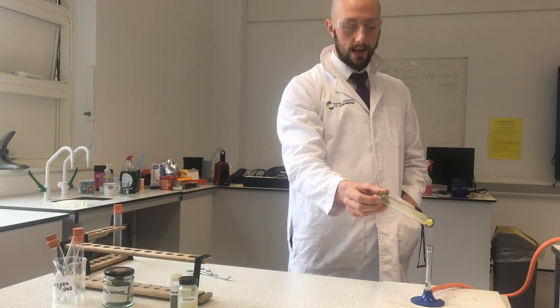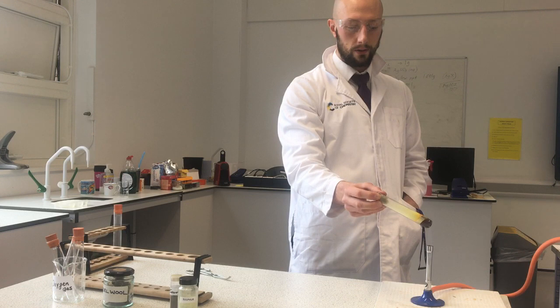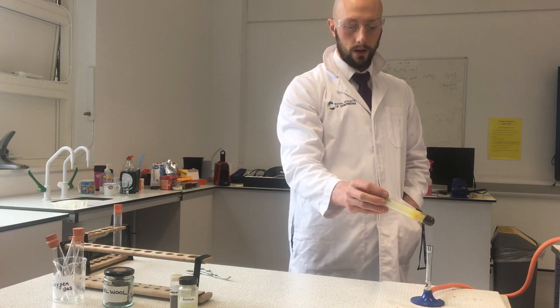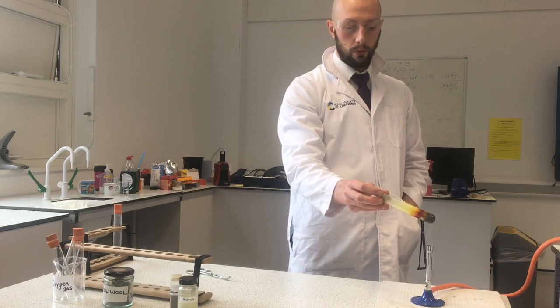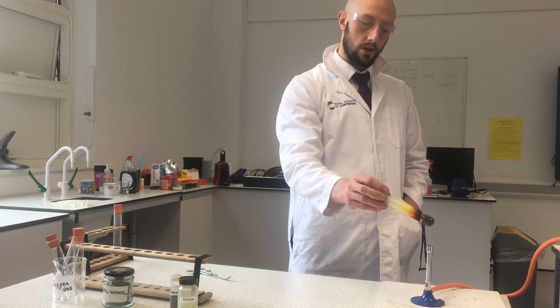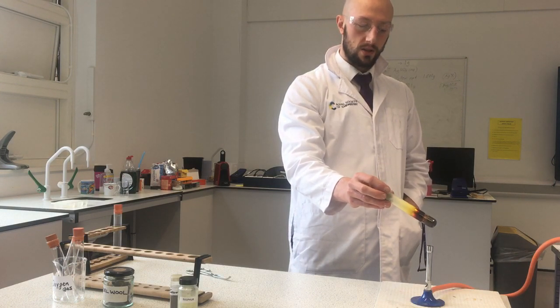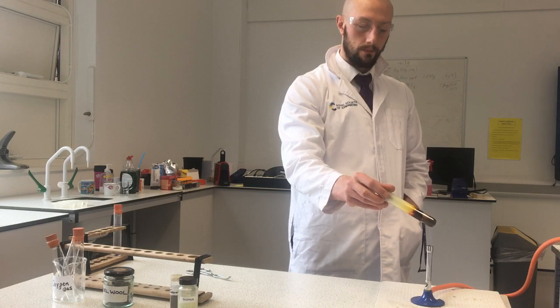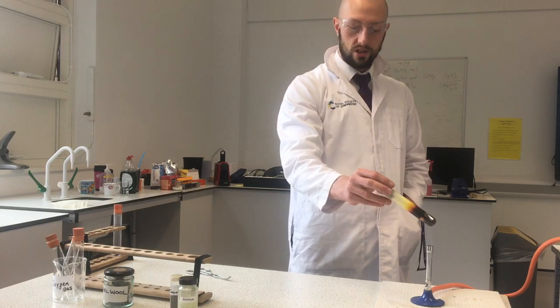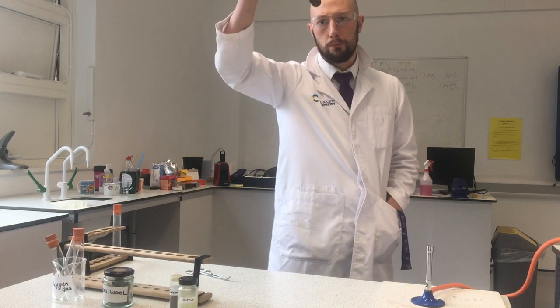Now as I heat it, we can see it's getting hot and it's going a bit black, but we're not seeing much energy released from it. We're not seeing a huge amount of a reaction. There's all that sulfur boiling to form a gas. It's actually subliming. But here we go, we've got some reaction going on, but it's not much going on. We can't see any light coming off it. We're not seeing an explosive or a particularly reactive reaction. So that is my sulfur reacting with iron. It's gone a bit grubby, but we didn't see any sort of bright reaction.